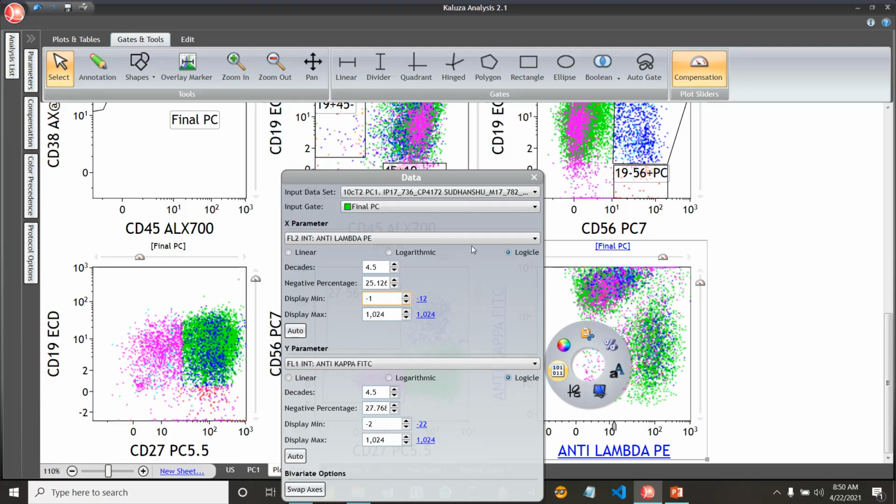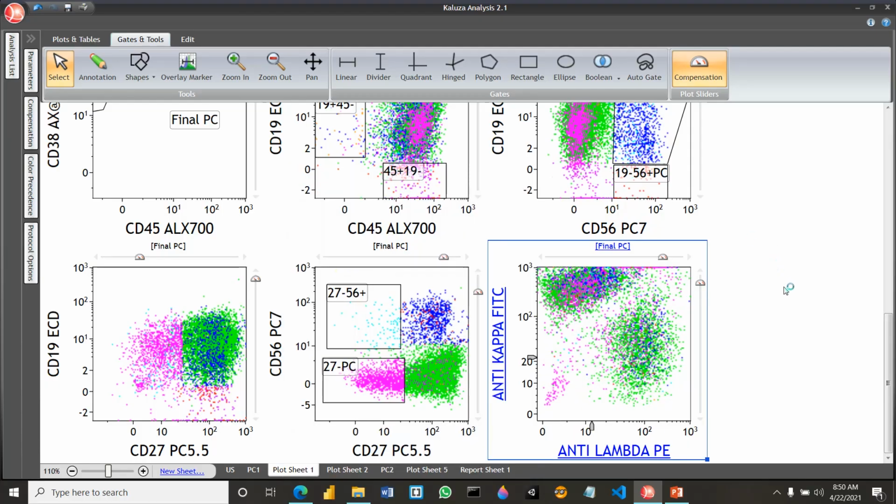See, the light chain expression in myeloma is very strongly expressed. So you have to be very careful when you are interpreting the data or the analysis. You have to adjust in such a way that you can get this. So if you look at all plasma cells, they look pretty polyclonal. Just to confirm their percentages of kappa and lambda, let's see.